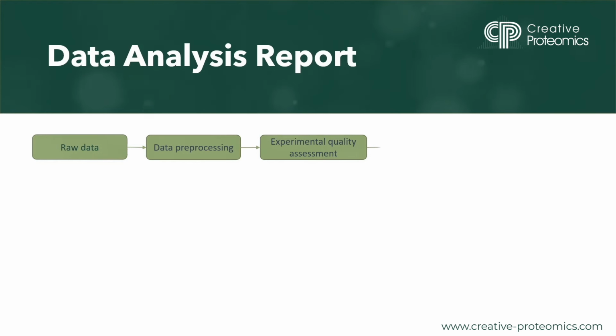To ensure the reliability of our analysis, we assess the quality of our experimental data. We examine factors such as reproducibility, instrument performance, and overall data quality. This assessment helps us validate the robustness of our results.